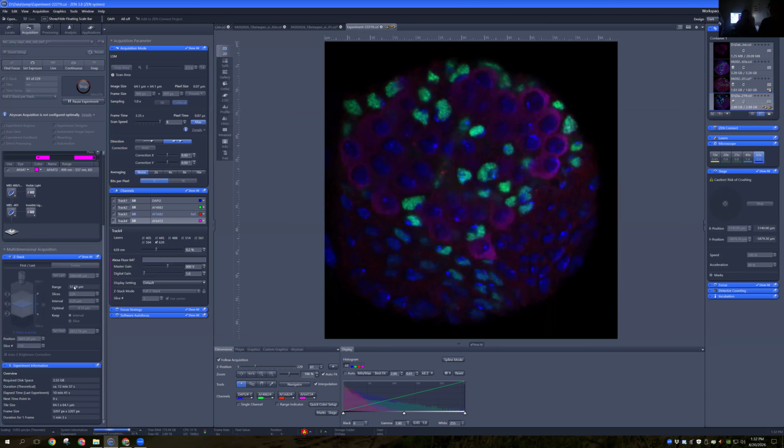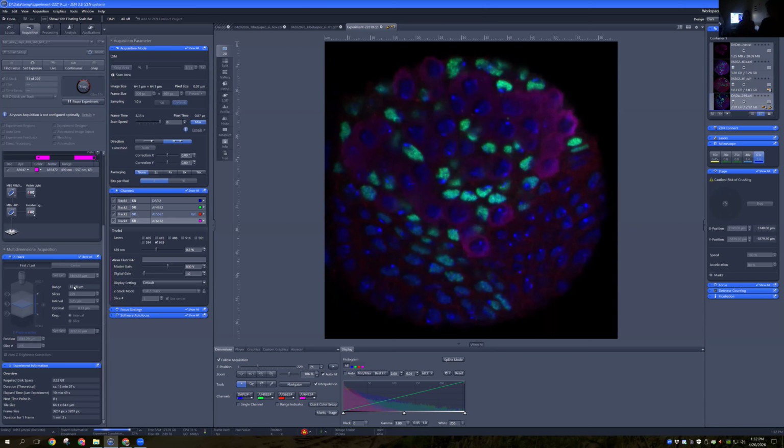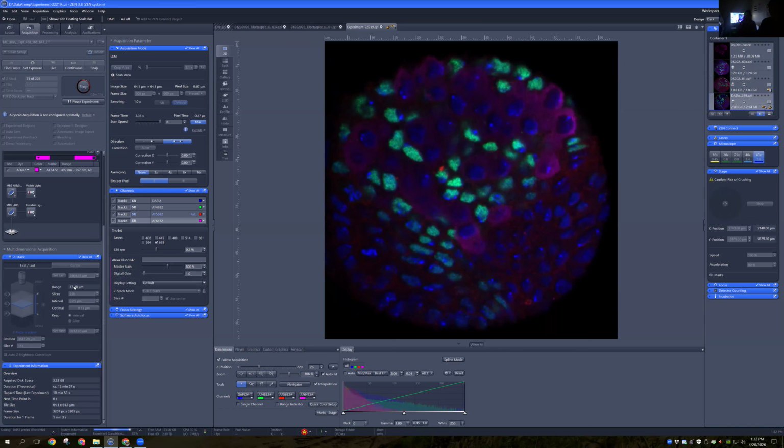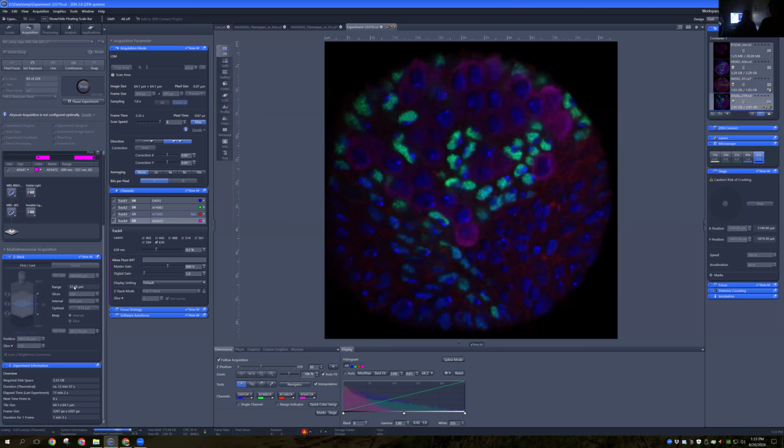Currently in the lab, but I did have someone who had previously worked in the lab and then left for another position. He recorded videos of himself doing the dissections, and those were saved internally in the lab. So I was able to watch those videos and basically try to replicate what he was doing. But it took a really long time.